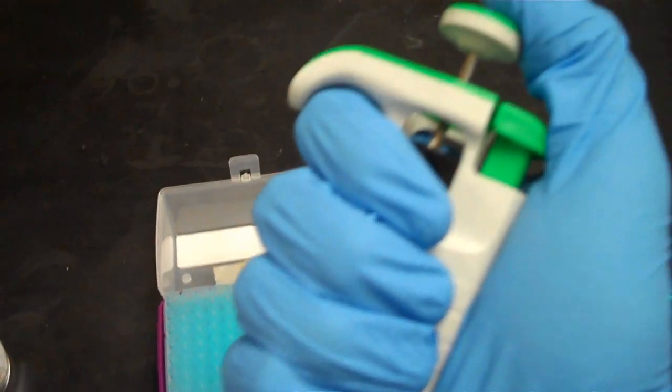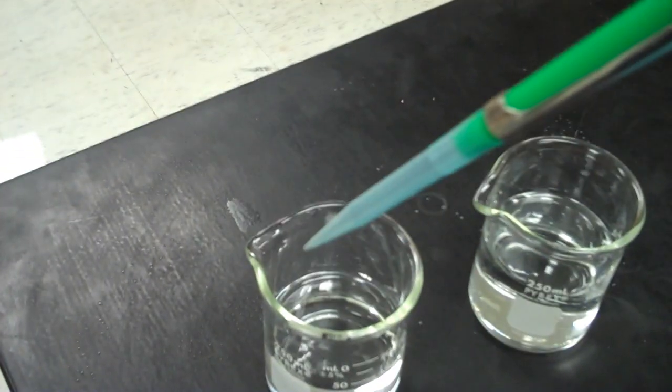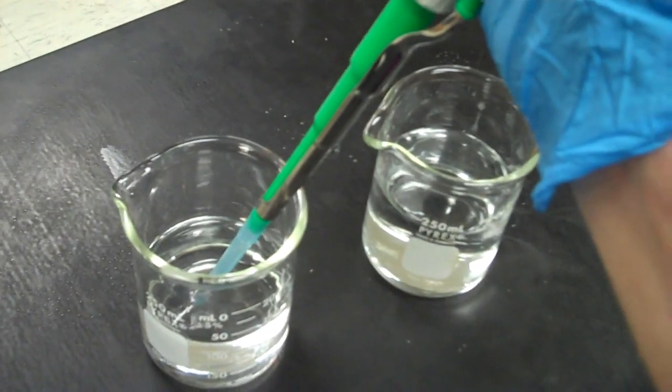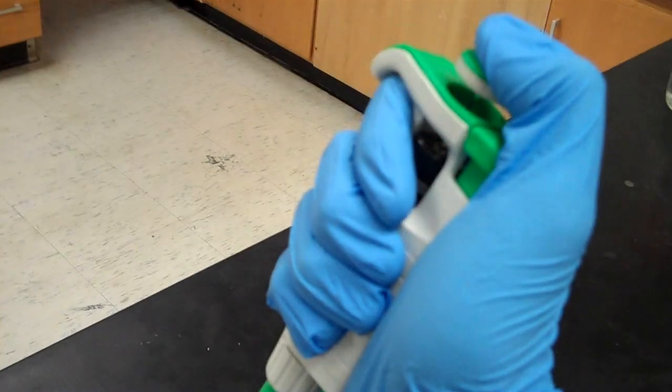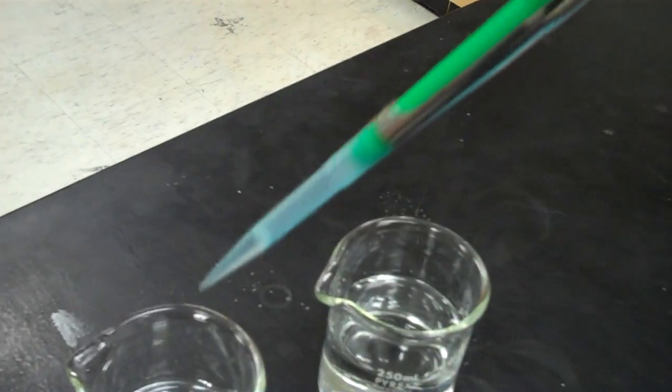Now in order to pipette, you must push the plunger down and hold it down with your thumb. Put the tip in the liquid making sure the actual pipette doesn't touch the liquid and slowly release the plunger, drawing the liquid up into the tip of the pipette.